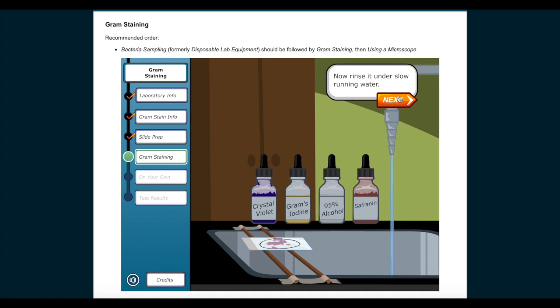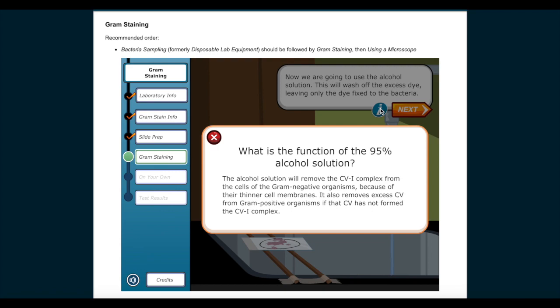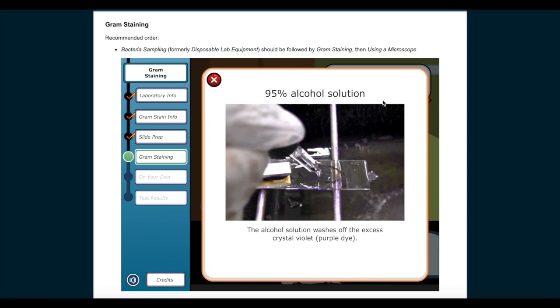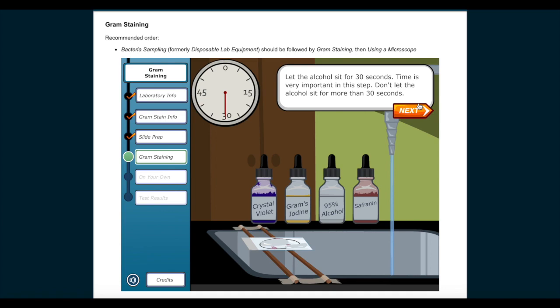Now we are going to use the alcohol solution. This will wash off the excess dye, leaving only the dye fixed to the bacteria. What is the function of the 95% alcohol solution? The alcohol solution will remove the CVI complex from the cells of the gram-negative organisms because of their thinner cell membranes. It also removes excess CV from gram-positive organisms if that CV has not formed the CVI complex. Use the alcohol dropper to cover the sample in alcohol. Let the alcohol sit for 30 seconds. Time is very important in this step. Don't let the alcohol sit for more than 30 seconds. Now rinse it off under slow running water.